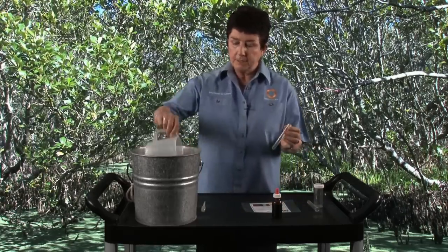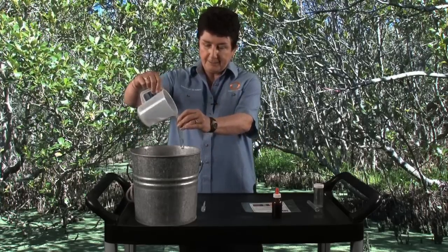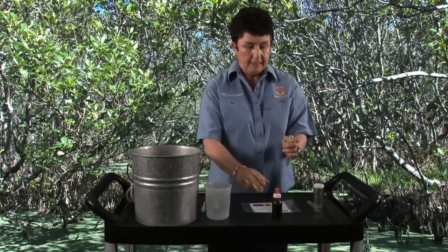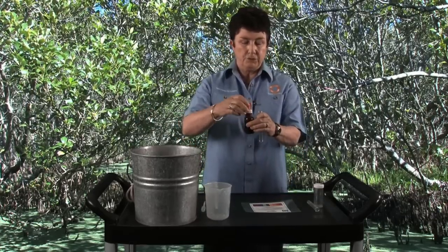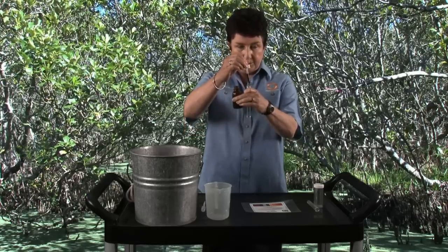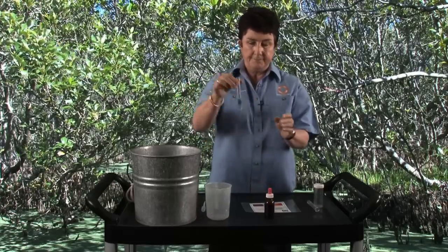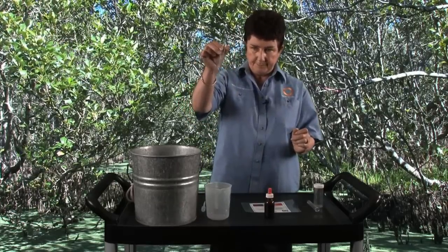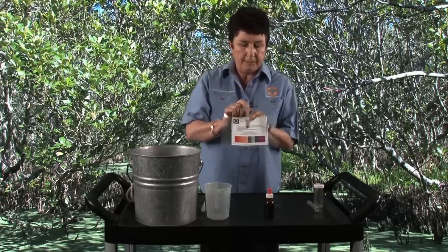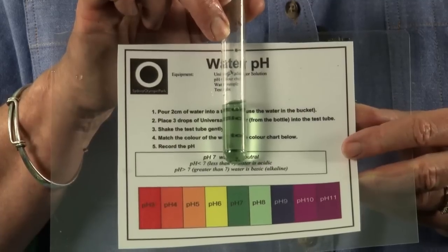Firstly, I will gather the sample into the test tube — approximately two centimetres or two fingers worth of water — and then three drops of universal indicator added into the test tube. We give that a good shake to mix it up, and then we read the result against the pH colour chart. Today, the creek water is pH 7, which is neutral.